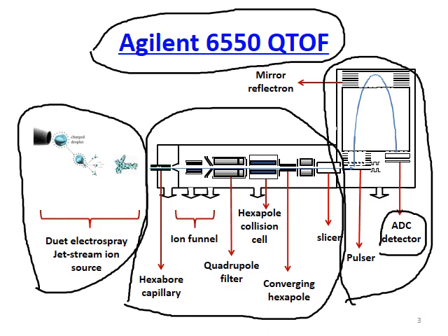In the next 2 slides, we are going to discuss how the specific design affects ion abundance, which is equivalent to, say, mass sensitivity, and also how the specific design affects mass accuracy as well.